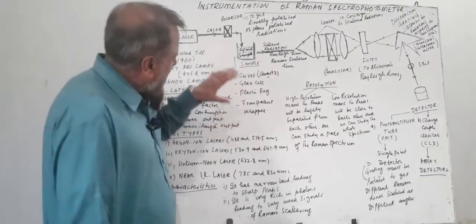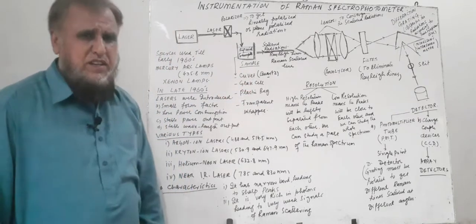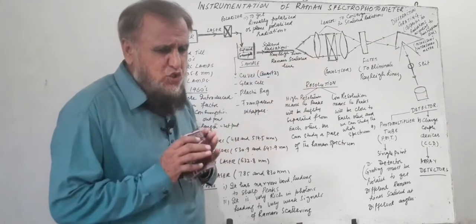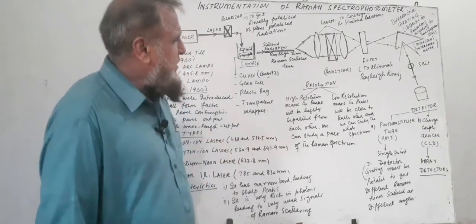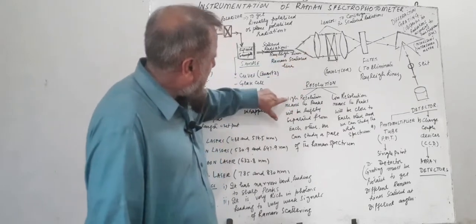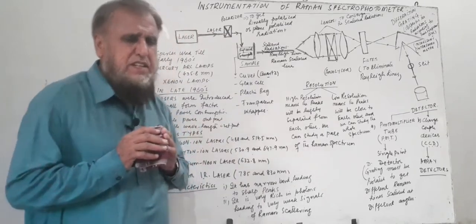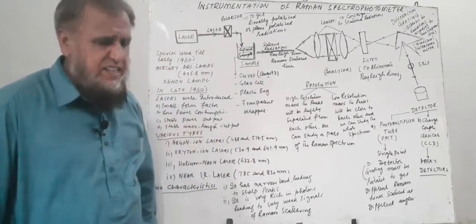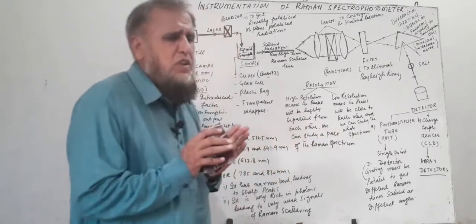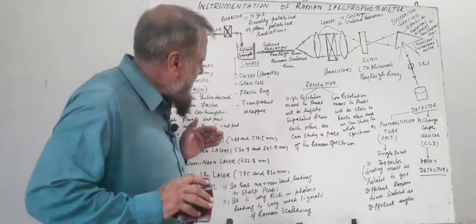Now, every Raman spectrophotometer has a resolution. The resolution of the spectrophotometer means how well it can separate the different Raman scattered peaks. If the instrument has high resolution power, then the peaks will be separated from each other by a wider distance, and the photomultiplier tube can detect only a part of the Raman spectrum and cannot cover the whole spectrum, which will be a very wide spectrum.